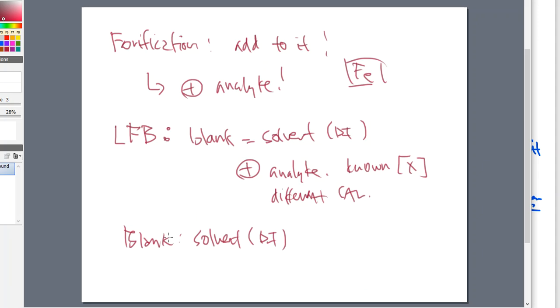Both of these go through the sample preparation. Both of these go through the heating, the cooling, the processing, the filtration, whatever the case is. They all go through the same process. The blank doesn't have, maybe in this case, any iron in it at all. It is truly a blank. And I hope that I get 0 as a concentration maybe, because there should be nothing there at all.